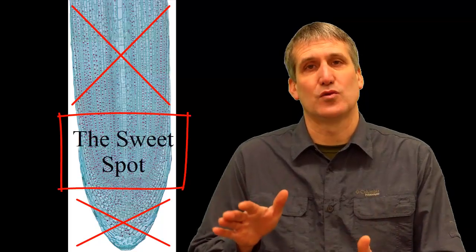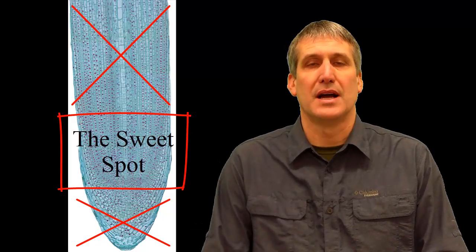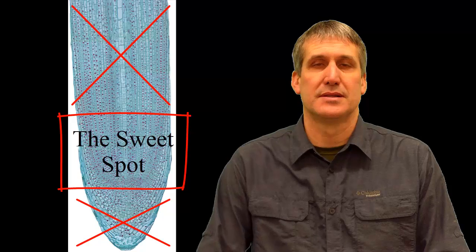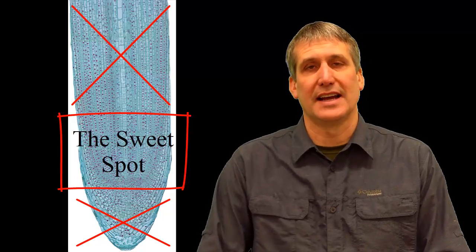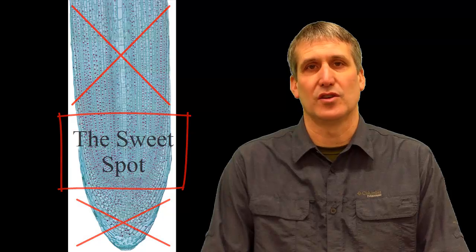You want to look right in that sweet spot just above the tip but not too far up on the onion root tip. This is where you're going to find cells that have been frozen in different stages of mitosis. And the reason you're going to be able to tell what's going on is because during mitosis the chromosomes condense and become visible in the light microscope.